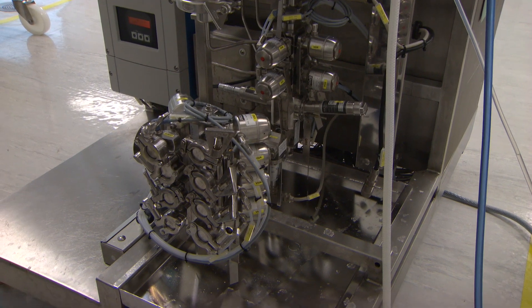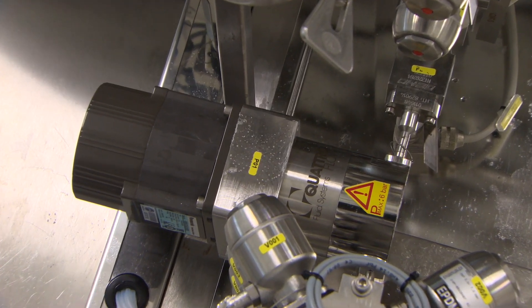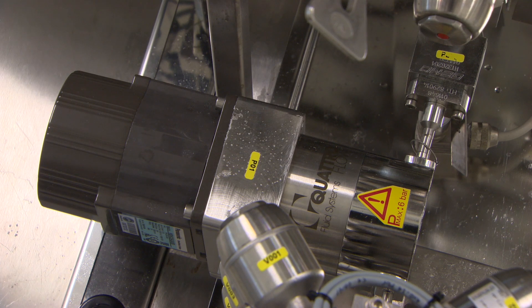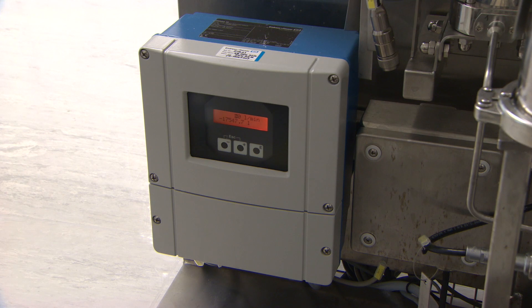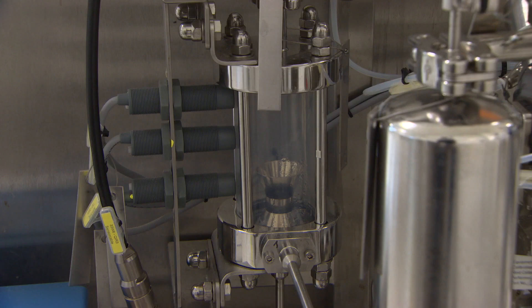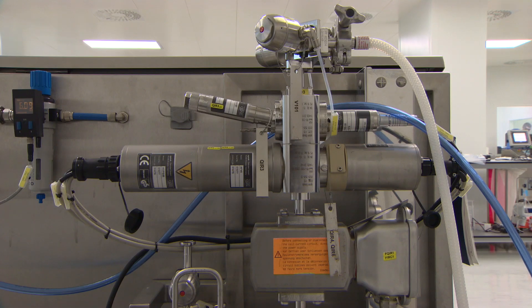The entire flow pathway may be traced out at the rear of the system. Liquid is delivered via inlet connections at the base of the system and flows under pressure from the pump through various valves towards the chromatography column. Along this pathway, process liquid may flow through a bubble trap and filter. The bubble trap ensures that any trapped air coming through the inlet connection is removed, while the 0.2 sterile grade filter is used for bio-burden reduction.